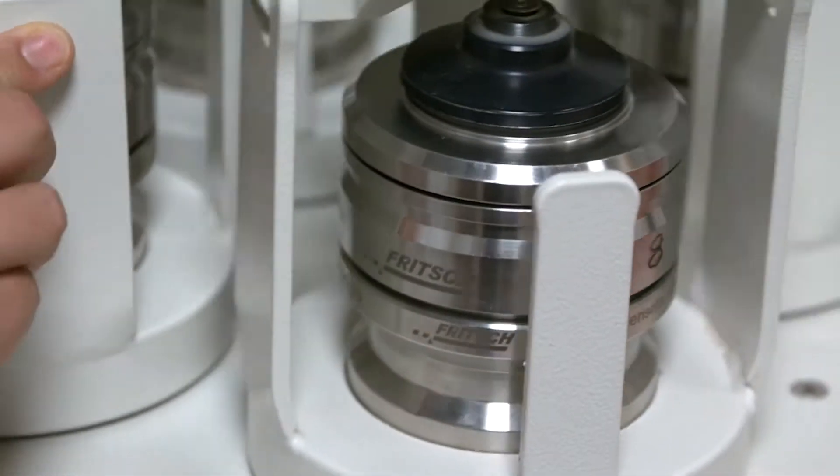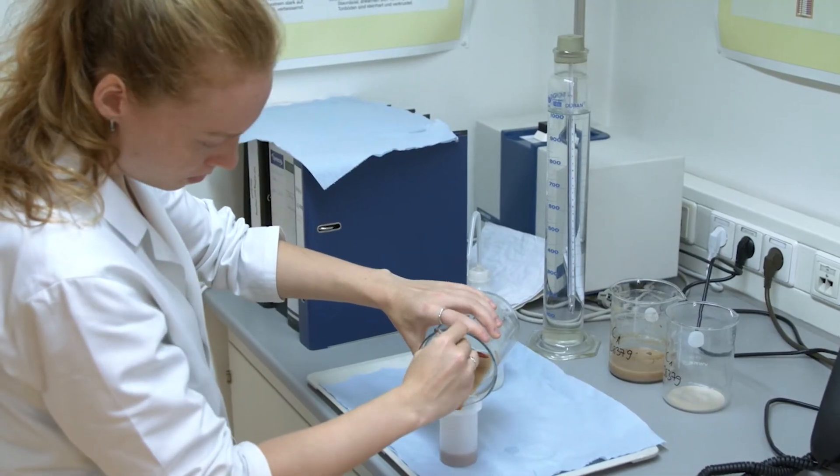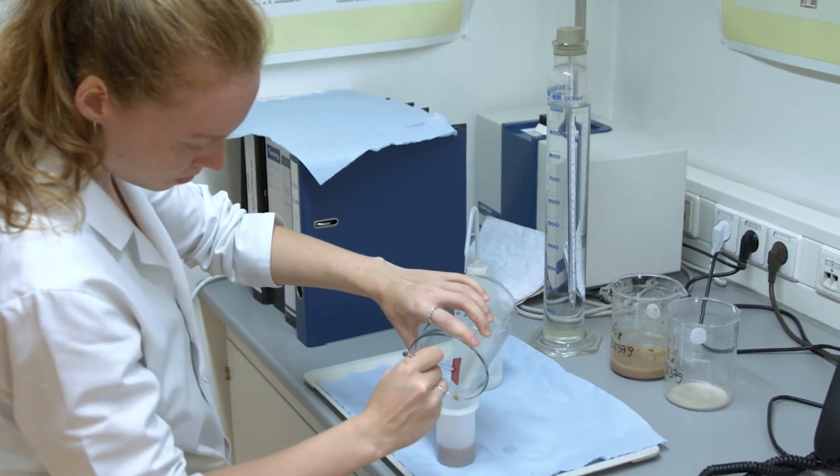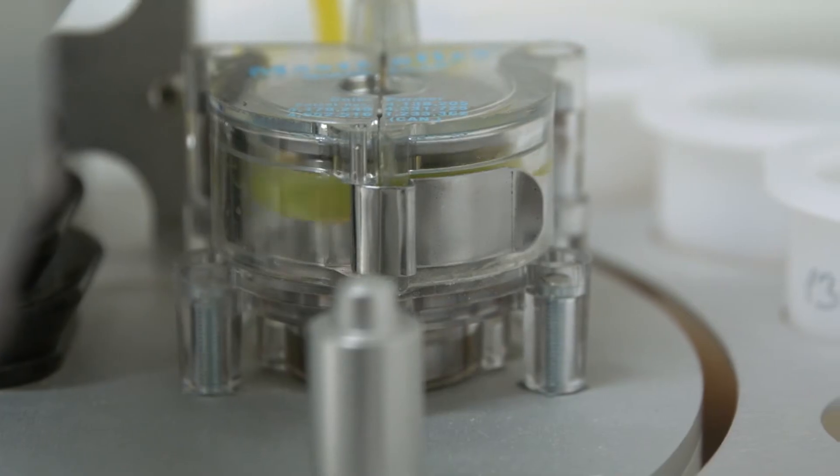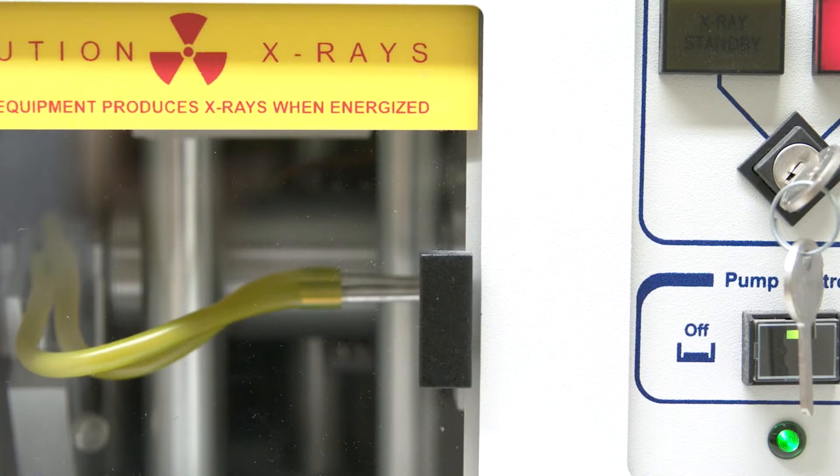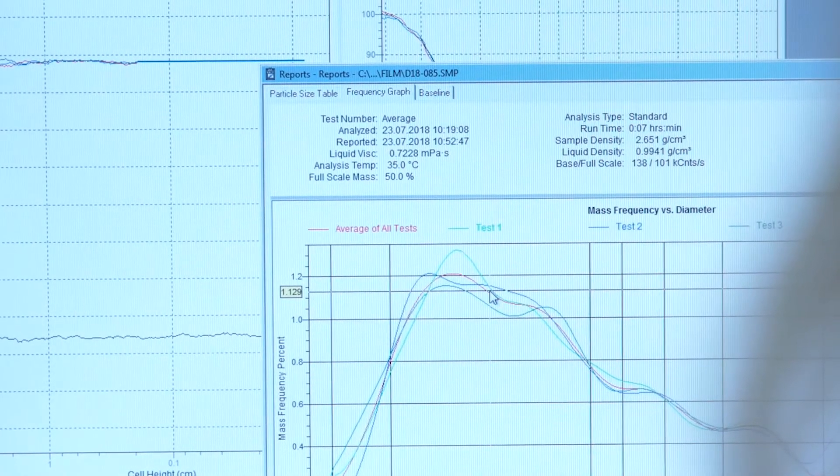Once the samples have been prepared, various analyses can be carried out. One of the most common methods for studying soils and sediments is grain size analysis. The different sizes of grain and their relative numbers are typical markers of geological parent material and soils developed from them.